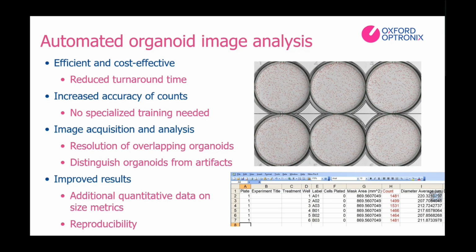Also, technological advancements have made it possible to integrate other analysis parameters into automated organoid counting platforms. And what this really does is it provides researchers novel insights and opportunities to capture and report additional qualitative and quantitative data, which just wasn't possible with manual counts. Researchers processing organoid formation samples with automated software can now not only generate total organoid counts, but can also collect detailed size information. And here we're talking about things like organoid diameter or volume information.